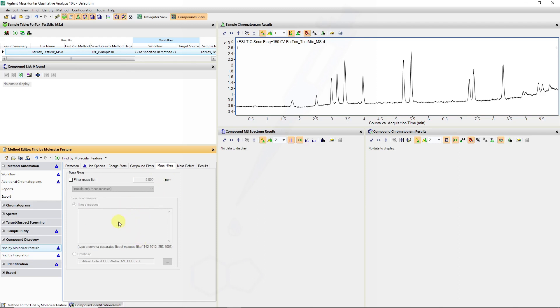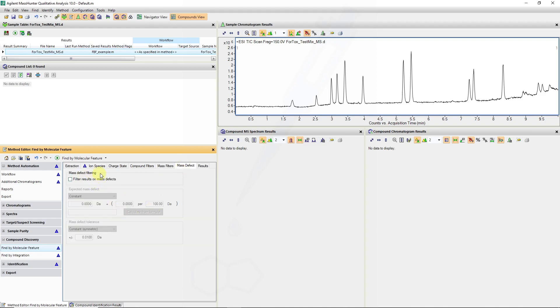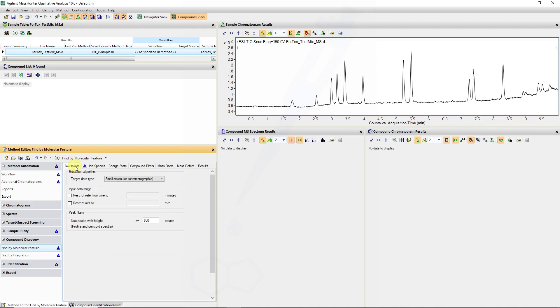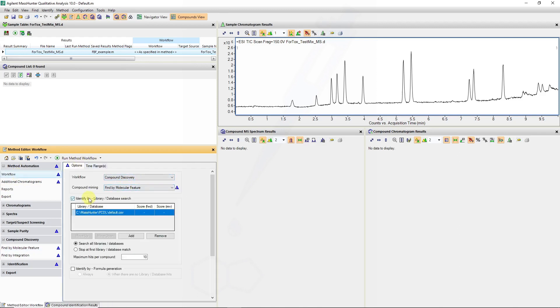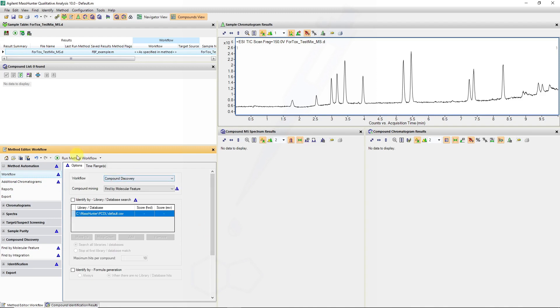For mass filters, an inclusion or exclusion list can be added here to exclude certain features. The mass defect filtering can be used to select for specific types of elements, like chlorine or a phosphate backbone — the mass defect filter is quite useful, which we can touch on later. For the extraction, we will run this workflow without any library matching or formula generation options.